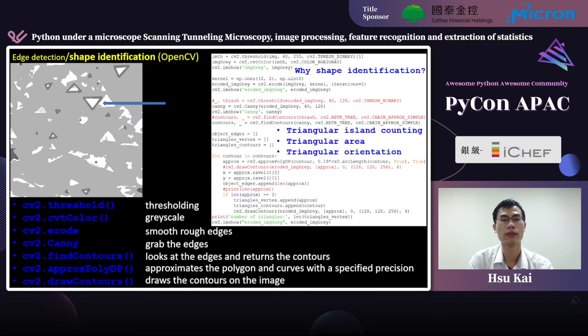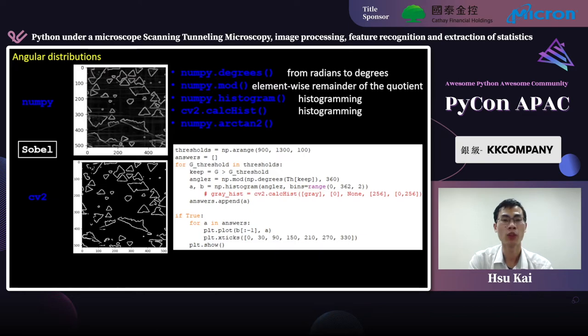So, the hard part here is to search for those optimal parameters that we can detect all the triangles that we want. We have to tune the parameters here and there, sort of trial and error. So, after we have Sobel operator and shape identification method to start with, we want to reflect the extracted information in an intensity versus angle plot. Here I use NumPy histogram to do that. And I divided intensities into angles from 0 degree to 360 degrees. You can also use OpenCV calcHist to do the same thing. And here I also use NumPy degrees to convert the angles from radians to degrees. And I use NumPy mod to confine the angles to be within the range of 0 degree to 360 degrees.